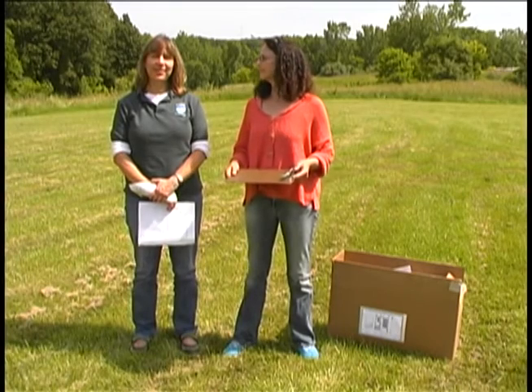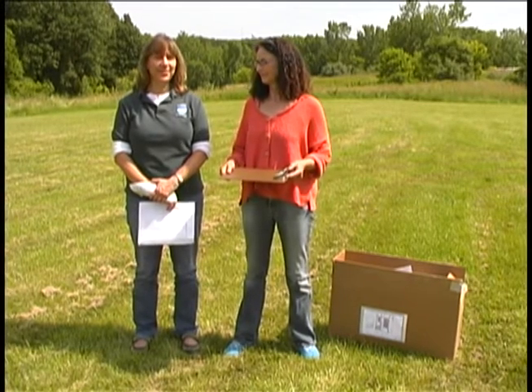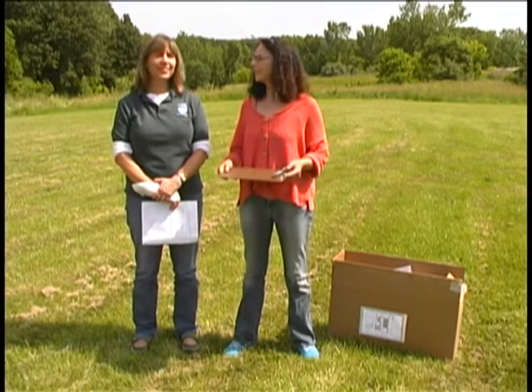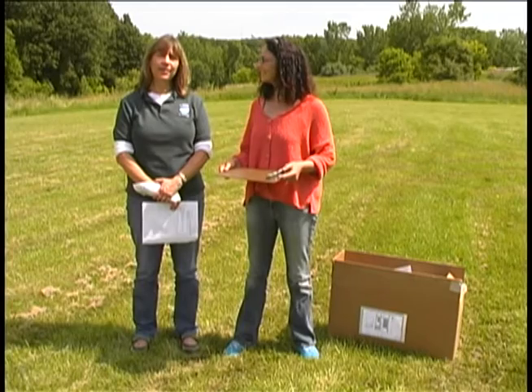Hi, my name is Randi Walker and I'm with the New York State Department of Environmental Conservation's Community Air Screen Program. I'm Joan Kennedy and we are going to show you how to take a good air sample and how to use the equipment.